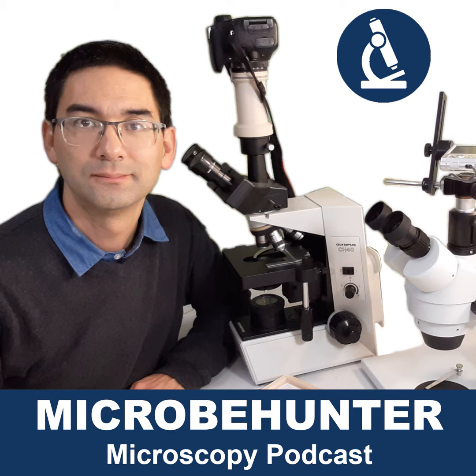Okay. However, I do not want to generalize, because there are also some good points that speak towards stereo microscopes as well. So, for example, if you already have a hobby that you're interested in, like stamp collecting, coin collecting, mineral collecting, or maybe you're collecting and pressing flowers, or insects, then I would highly recommend that you get yourself a stereo microscope first, because this existing hobby can really benefit from that.